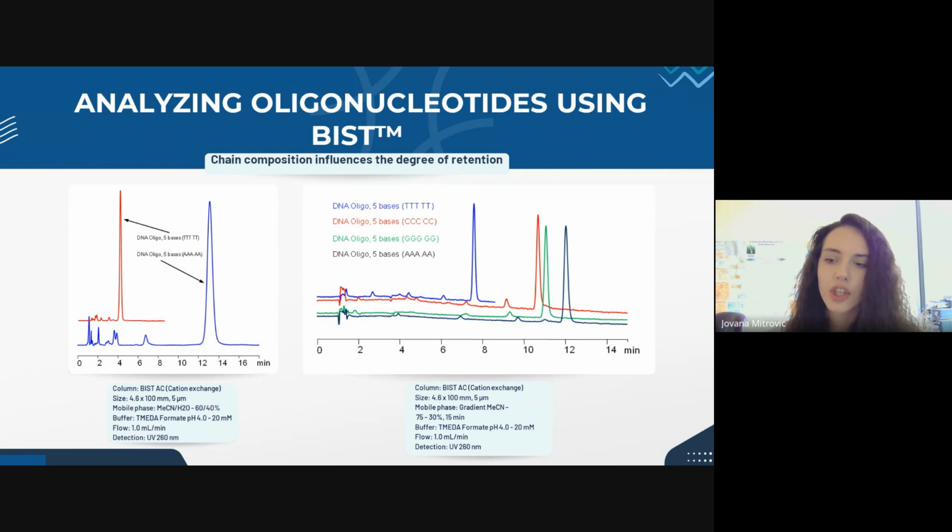The basicity of nucleobases A, T, G, and C can affect the local charge distribution and interaction strength. Stronger basic groups influence the degree of negative charge on the adjacent phosphate backbone, which in turn affects how tightly the molecule interacts with the bridging ion and the stationary phase.